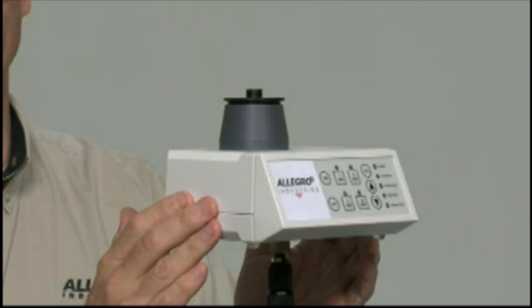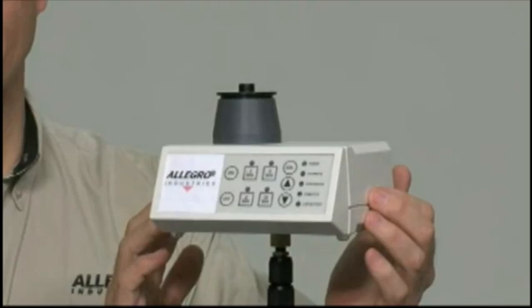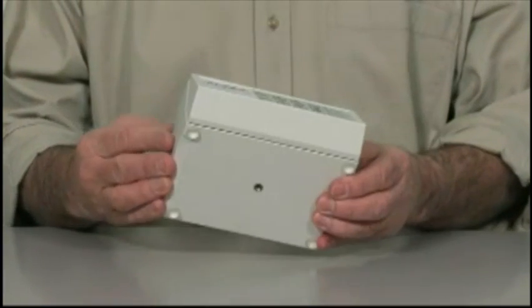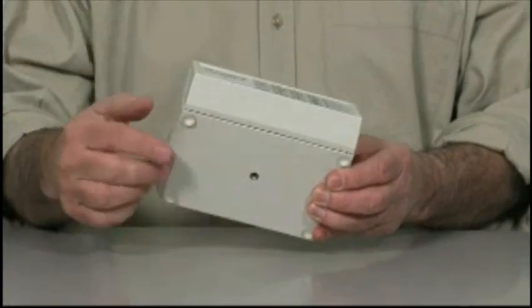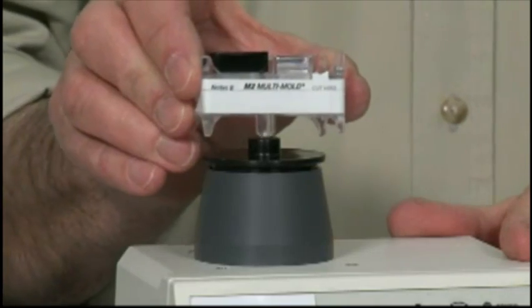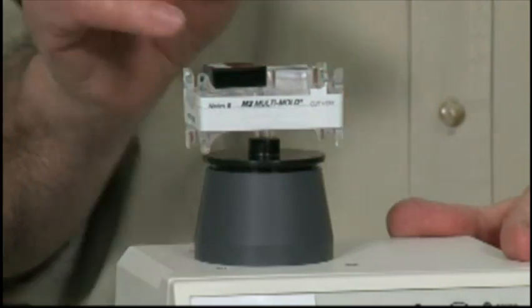Allegro also offers a DC sampling pump, which also samples for only mold. This pump is quiet and battery operated, which is great for remote locations. The DC sampler comes with a special stand that attaches to the bottom of the unit for quick and easy setup and sampling. Instead of using tubing to attach the sampling cassettes, they are attached directly to the pump.